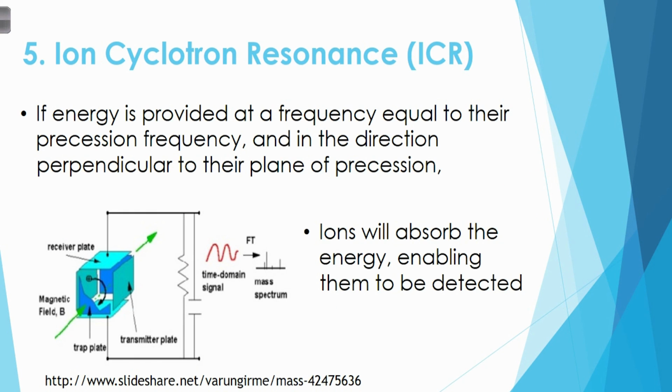If the energy is provided at a frequency equal to their precession frequency and in a direction perpendicular to their plane of precession, ions will absorb the energy, enabling them to be detected.